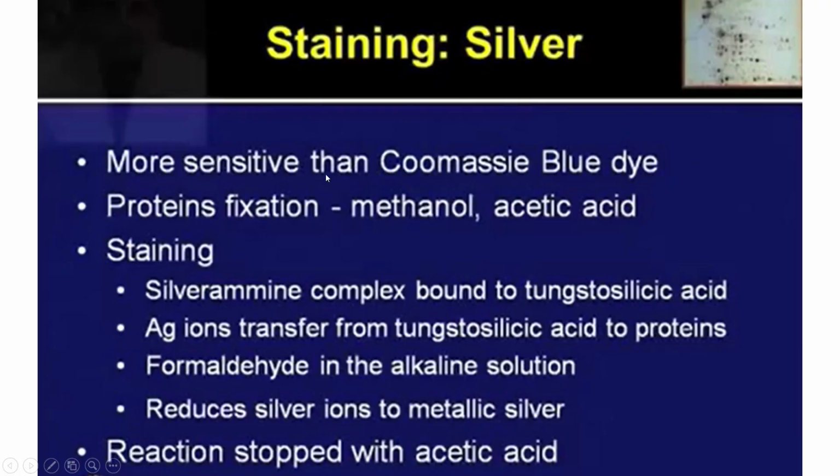Similarly, there is silver stain, which is more sensitive than Coomassie blue dye. For example, if you have any protein which is less concentrated, like maybe present in nanograms, then you can use silver staining instead of Coomassie blue.